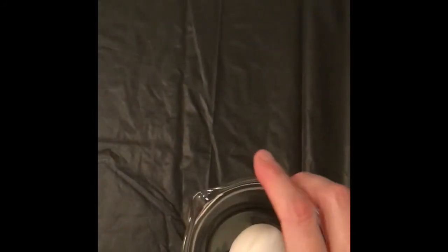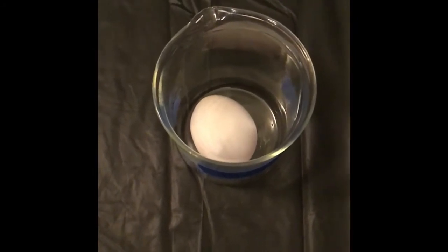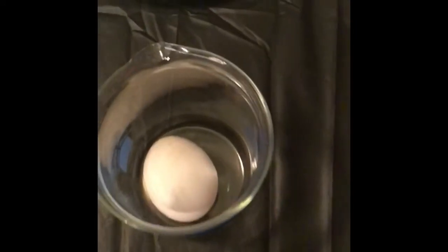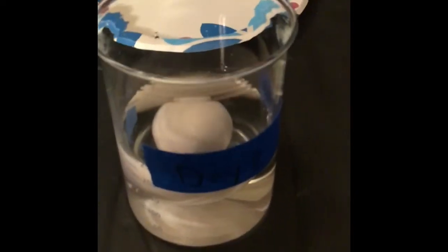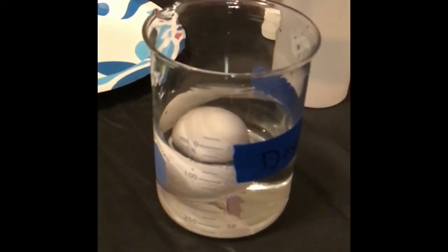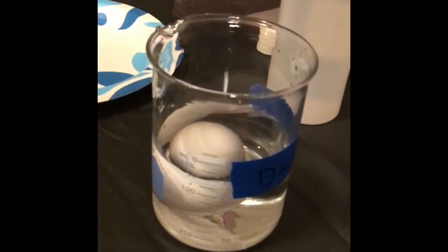Move that out of the way so I can move the beaker back. To finish up step 5, I'm going to pour vinegar in the beaker until it just covers the egg. This is just regular vinegar. Go ahead and make some initial observations. We've got an egg that's in vinegar, and it's going to sit in this vinegar for 24 hours.